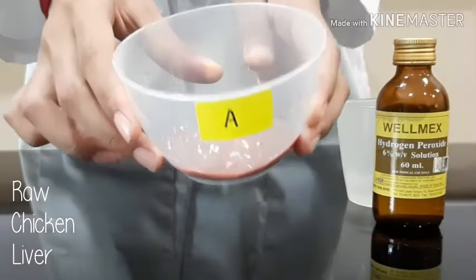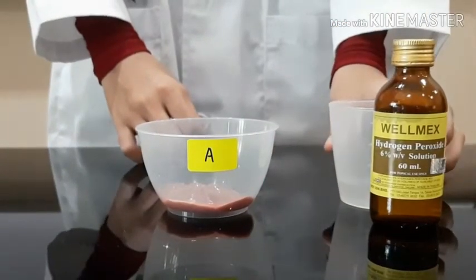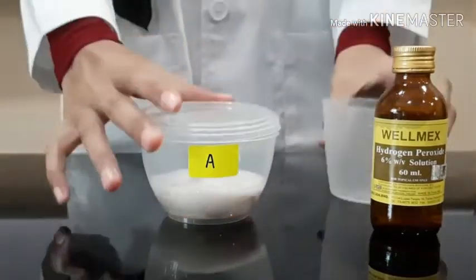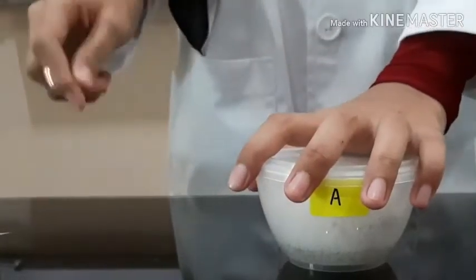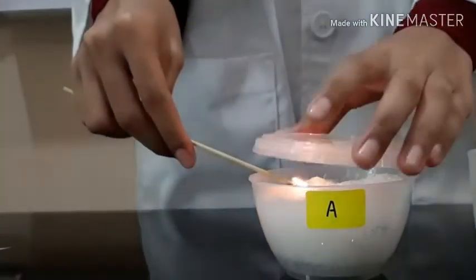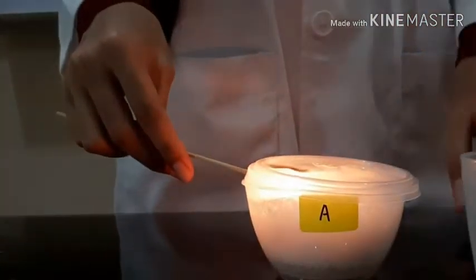Put raw chicken liver in container A. Then, pour 40 ml of hydrogen peroxide and close it. See, the wooden splinter is burning because this process produces oxygen.